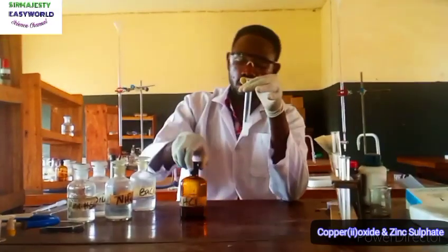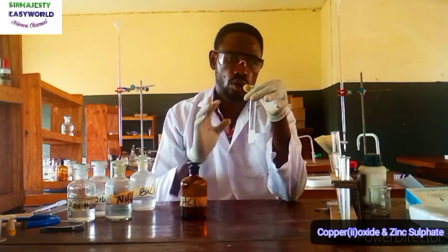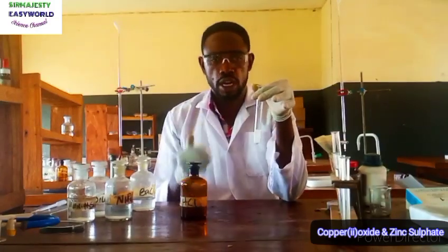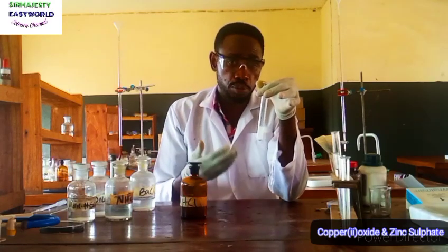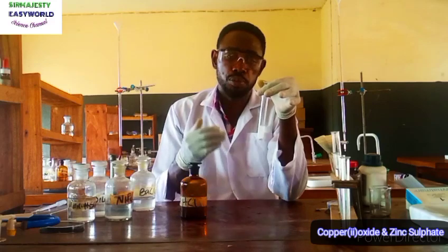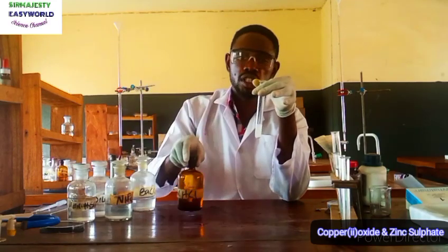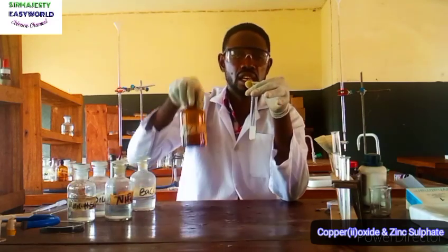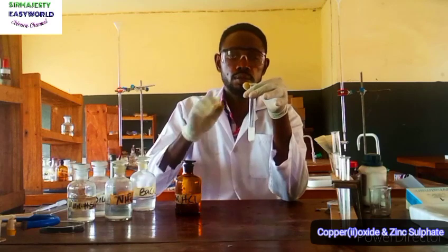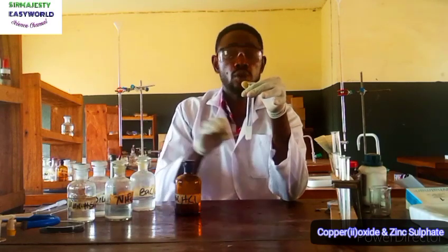Meaning, if this precipitate dissolves, it means SO3^2- or CO3^2-, because barium sulphite, that's BaSO3, and BaCO3 are all soluble in acids. But if it is SO4^2-, this precipitate will persist in HCl because barium sulphate is insoluble in acid, as it is also insoluble in water.